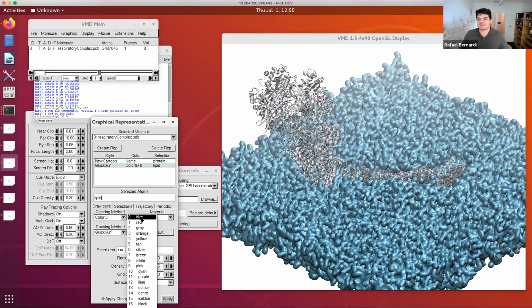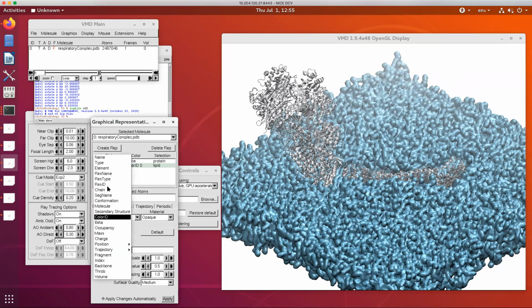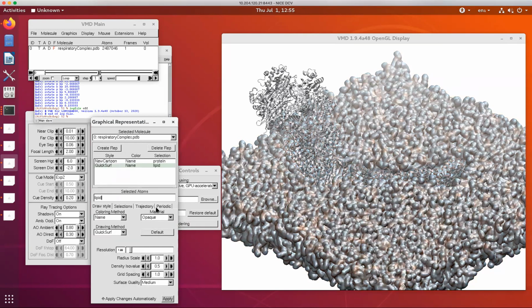Every time I load, it's faster. I don't need to worry. You can always map things inside, but I find it easier to just change the color. So it's up to you how you actually want to do those things. VMD is not very religious about this, and that's the point. Somebody might want to make their image with a whole bunch of different shades of blue.